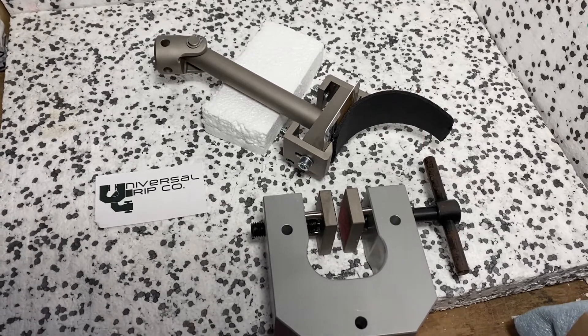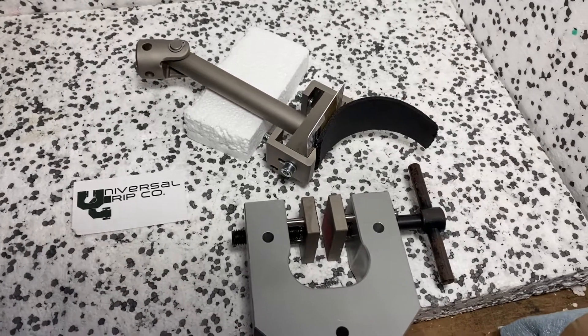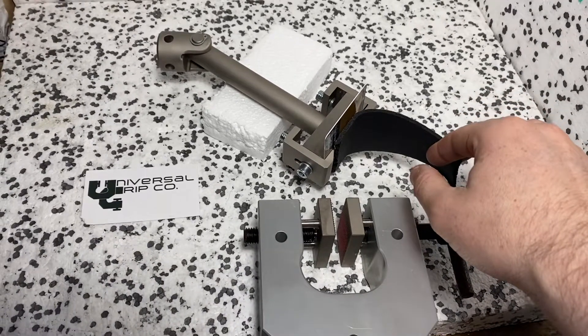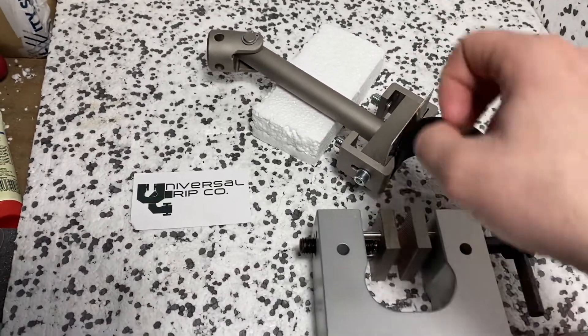Hello everyone. Today we are showing the ASTM D429 fixture. This fixture is used to test rubber that is adhered to metal substrates. This top fixture is the fixture specifically designed for D429.